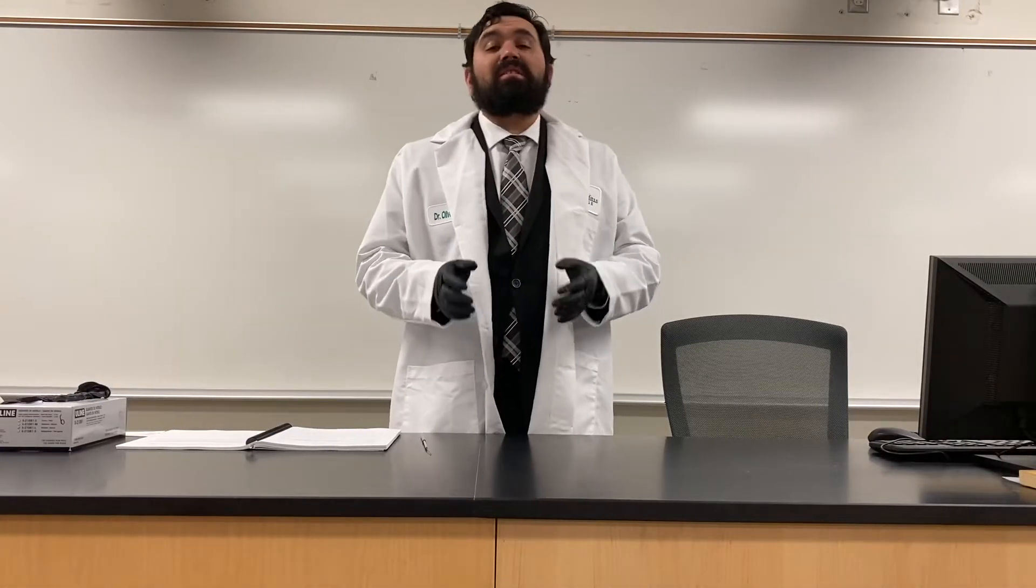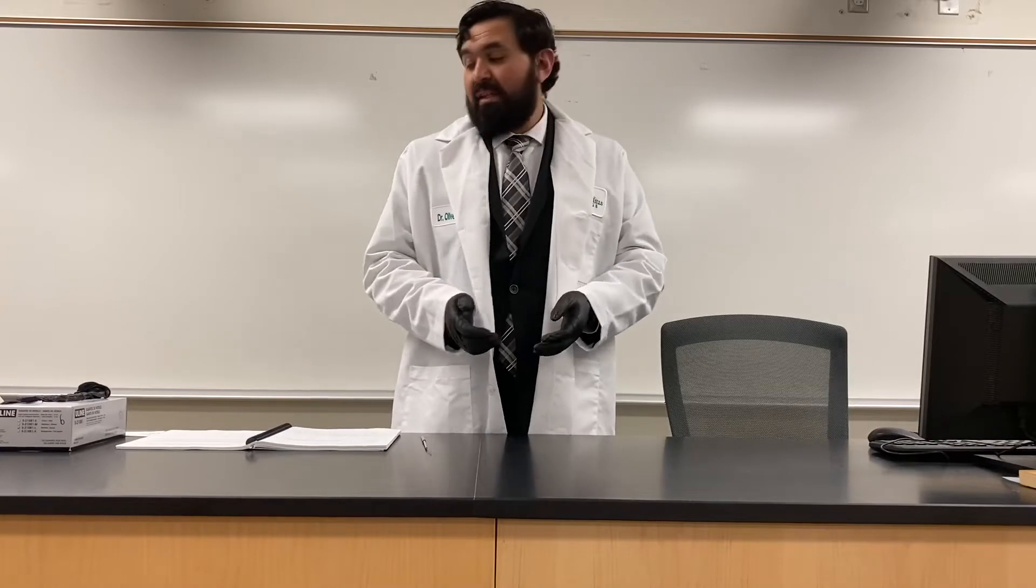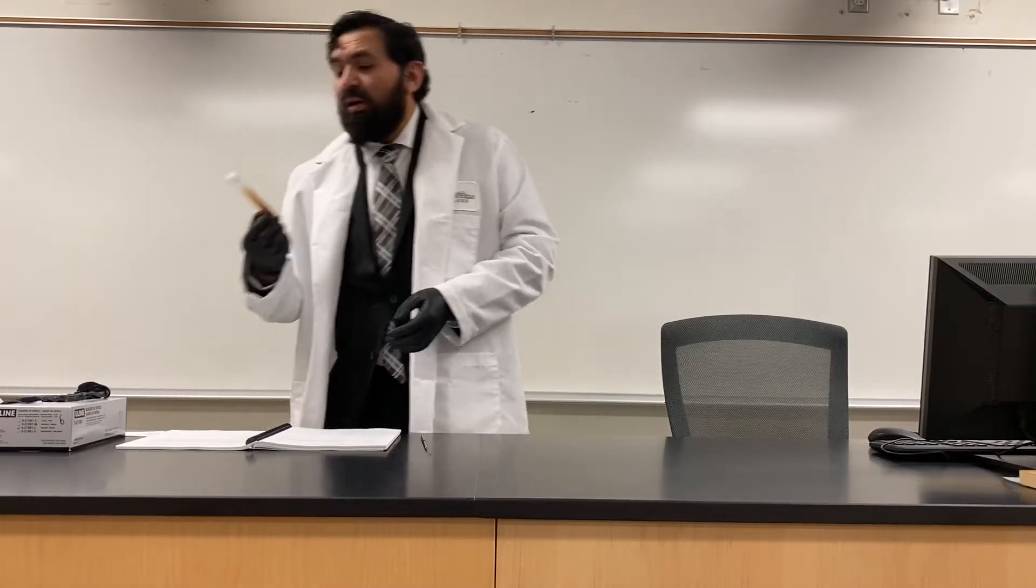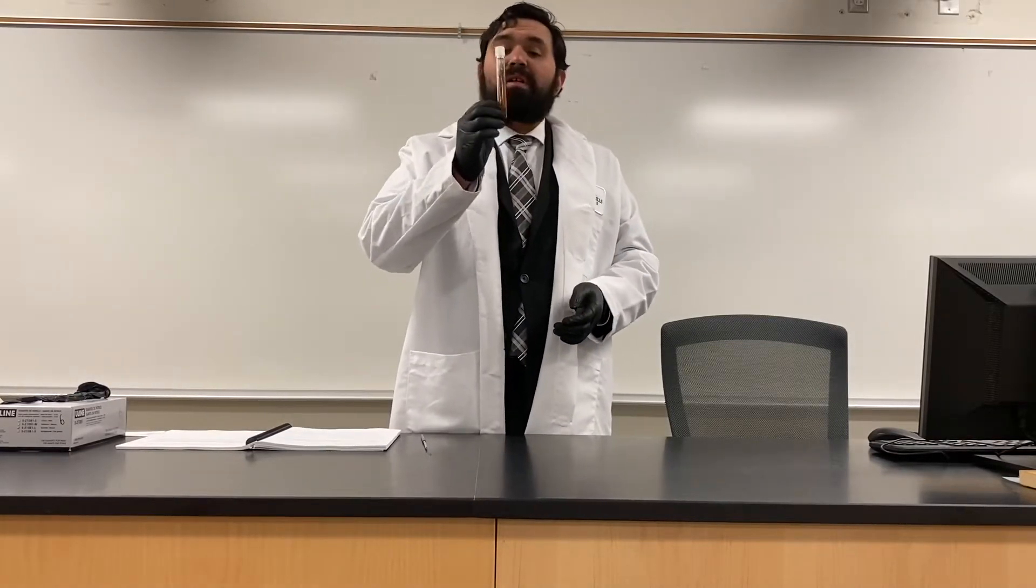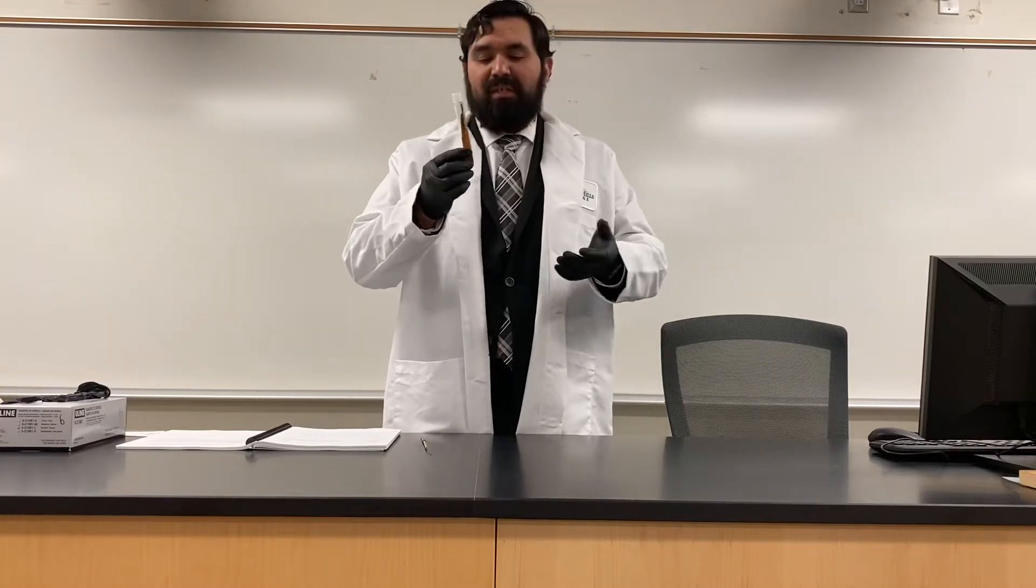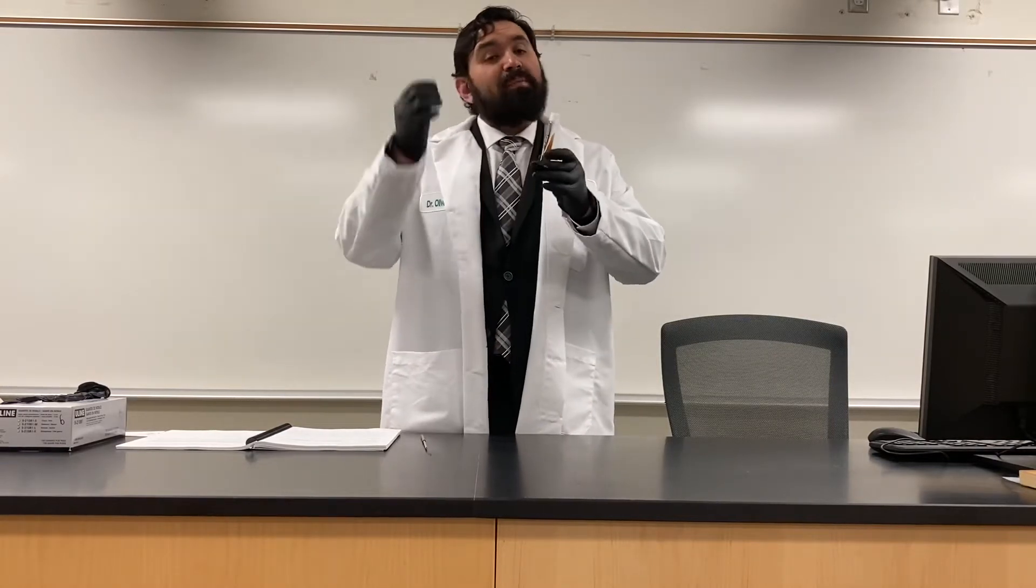For Lab 28, we're actually going to test another amino acid, in this case cysteine. What we have are TSI tubes, in this case Triple Sugar Iron TSI, in which we will inoculate it by stabbing it using a standard needle.